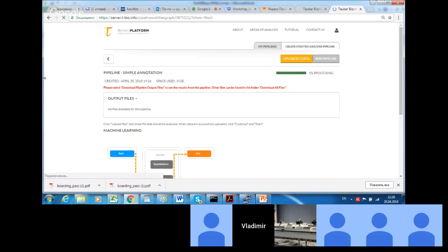But if the number of genes of interest, for example, the number of genes identified as differentially expressed with good adjusted p-value and good fold change, is relatively large, it's very hard to make conclusions just by looking at annotations of individual genes.